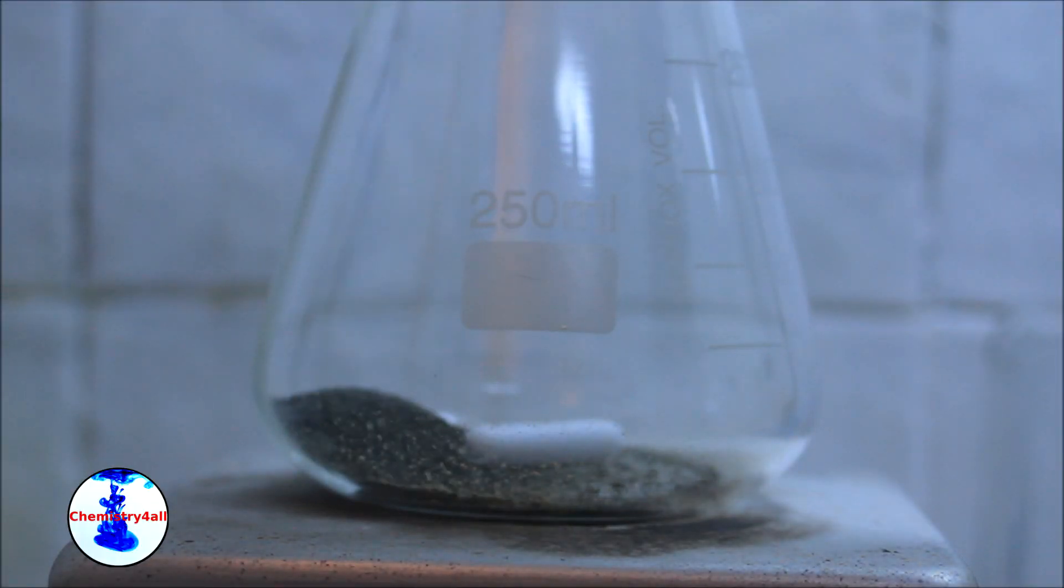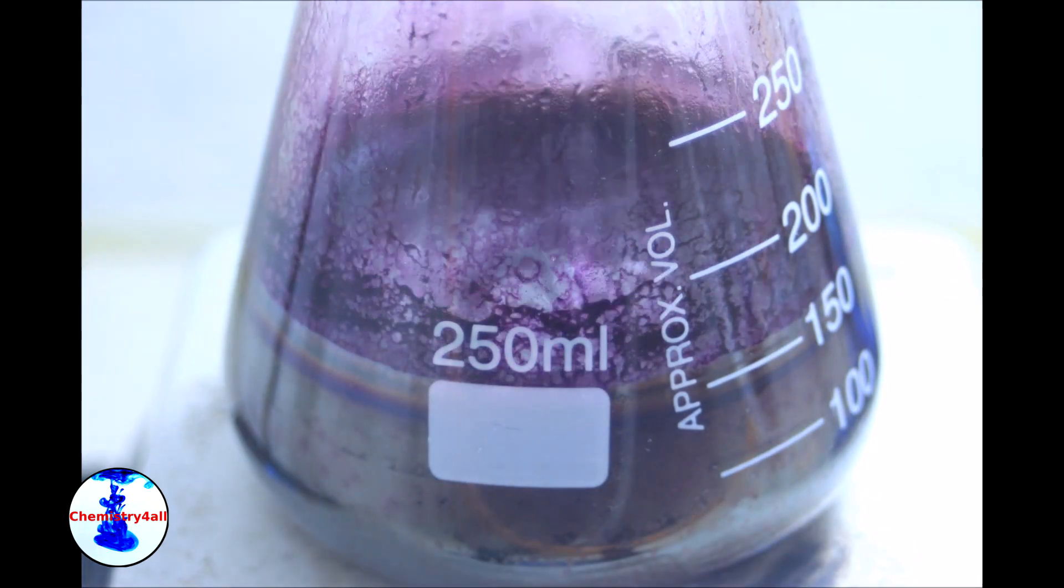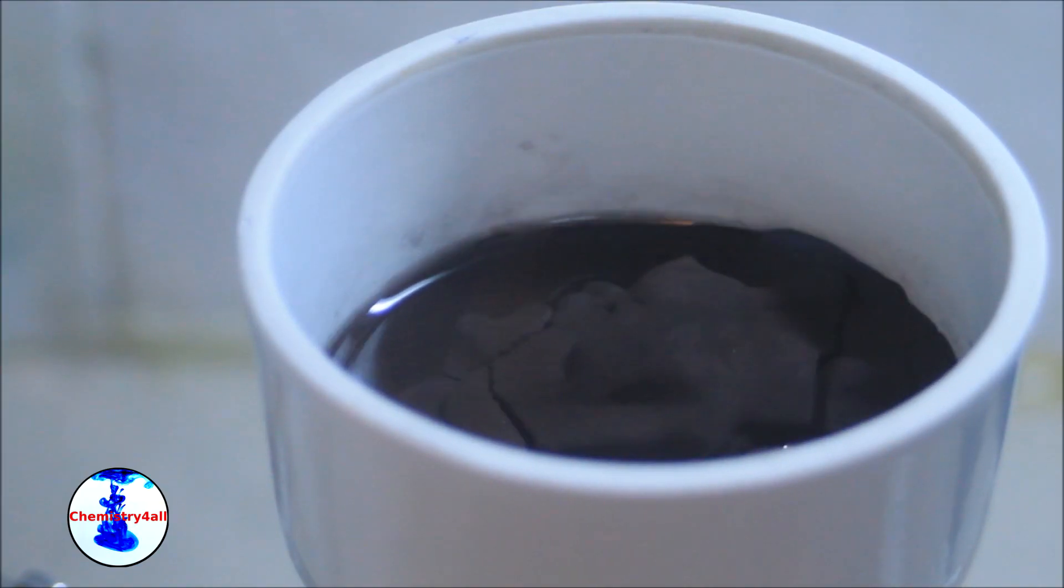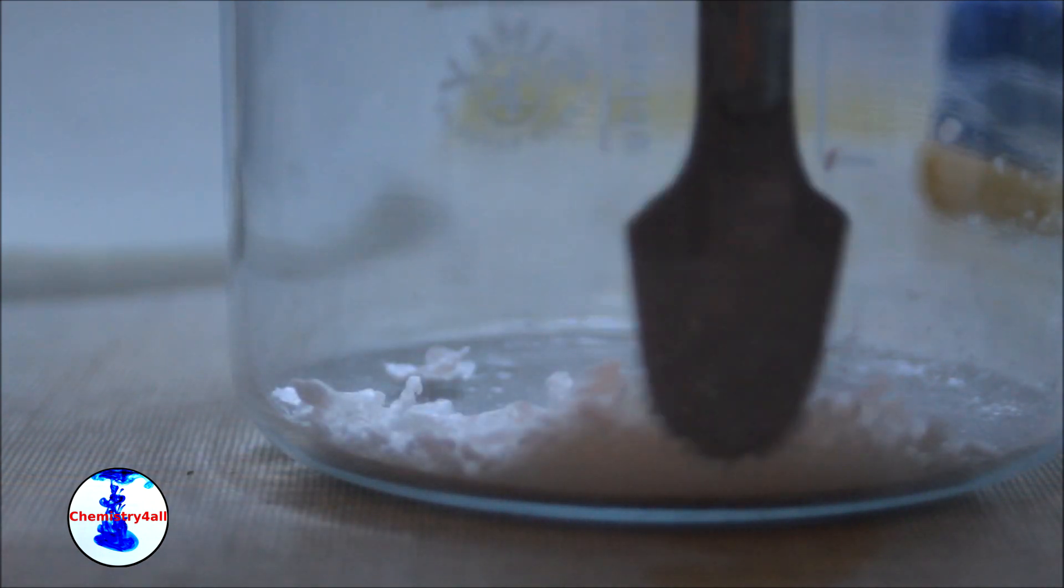Today, we will synthesize benzoic acid starting from toluene that we have obtained in a previous video from a paint remover. In order to do so we will carry out a classic benzylic oxidation of an aromatic alkane using potassium permanganate.